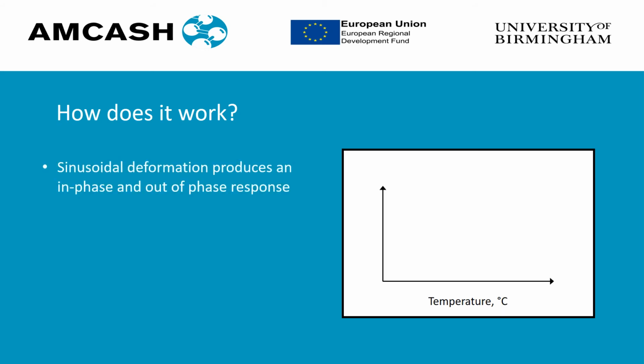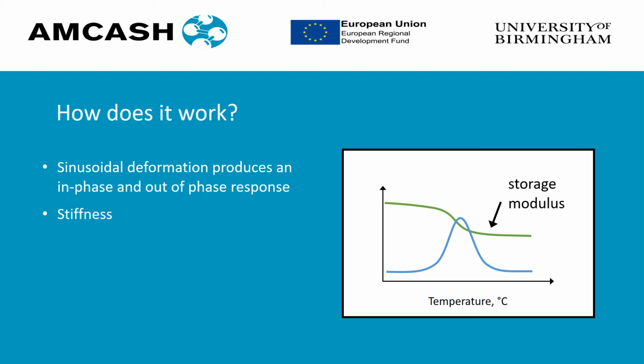Sinusoidal deformation produces an in-phase and an out-of-phase response. The elastic response, which occurs in phase or in sync with the deformation, is called the storage modulus, and it relates to the stiffness of the sample. The delayed out-of-phase response, which lags behind the deformation force, is known as the loss modulus. The ratio of the loss to the storage modulus gives us the tan delta, which is a measure of the damping behaviour of the sample. In other words, its ability to absorb and dissipate energy throughout the material.